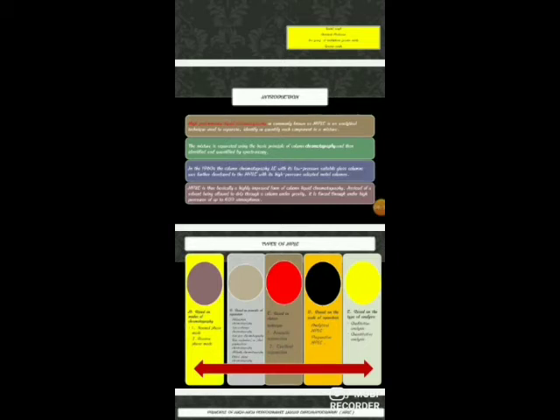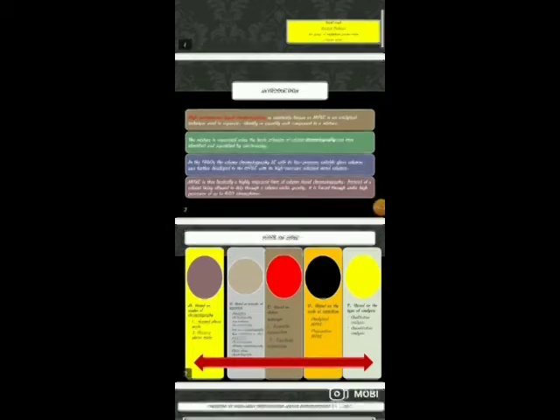Okay, now normal phase, the silica gel, a silanol group is present and responsible for polar nature. Silica gel is used in normal phase and it is responsible for polar nature. Now silanol group is present in three forms. First one is free silanol, vicinal silanol and geminal silanol.